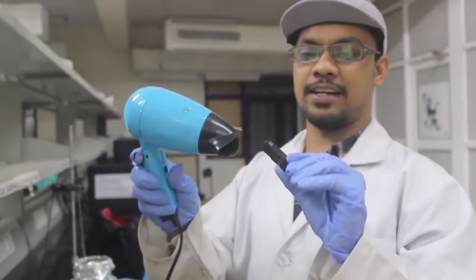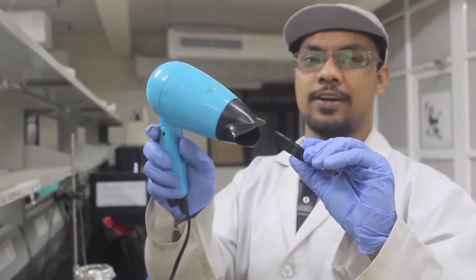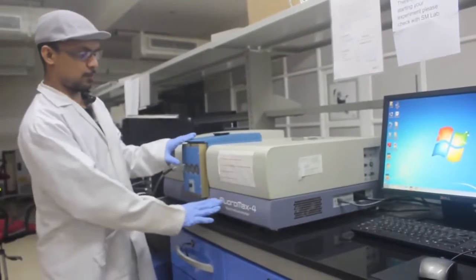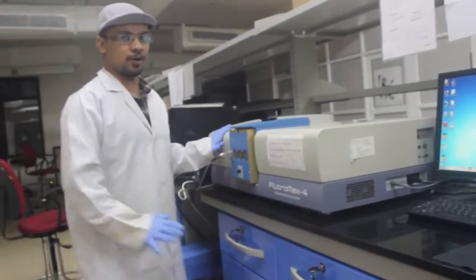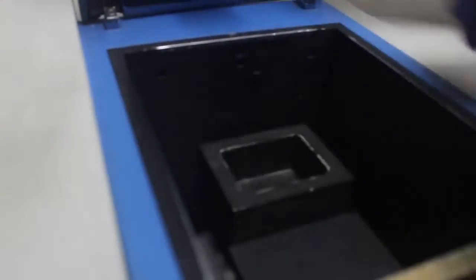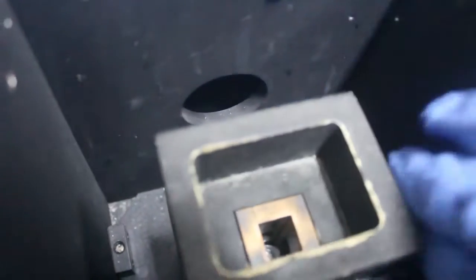After washing is done, you dry the cuvette using a hair dryer. This is the spectrofluorimeter—a FluoroMax from Horiba. You have the lamp here. You put your sample inside here, the cuvette goes in, and the excitation light comes from this narrow window. You take the emission and measure it from the detector here.